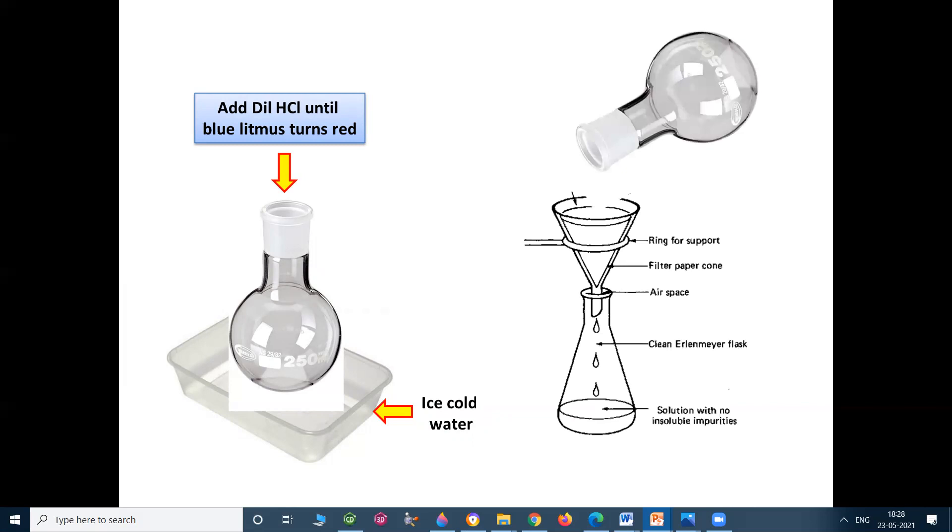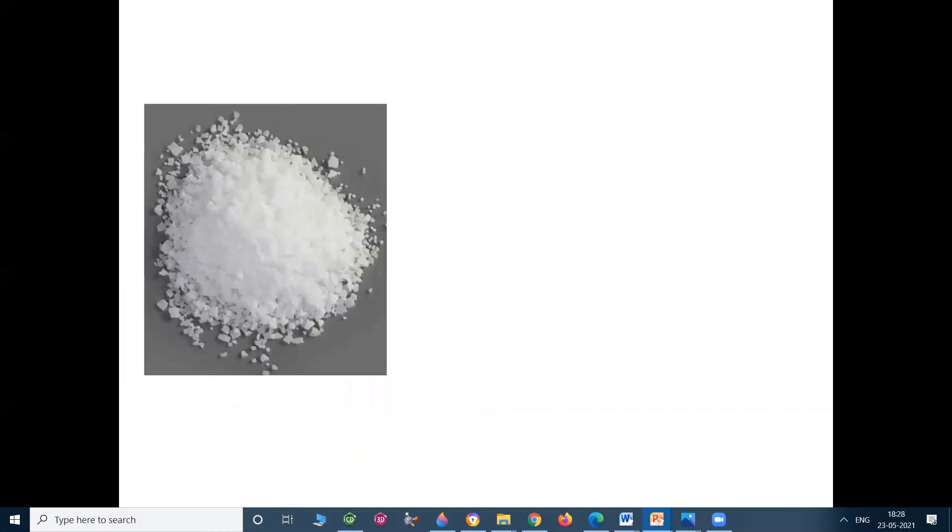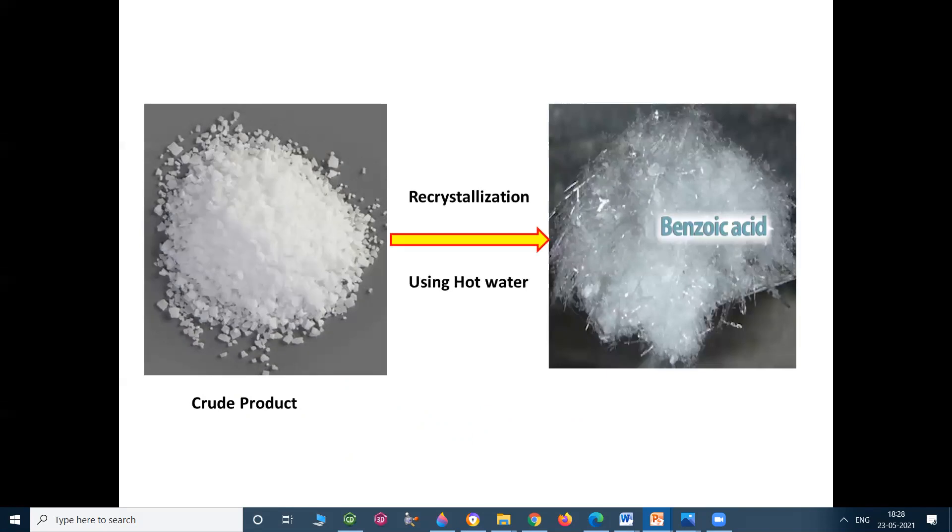Then filter the product by using filter paper and conical flask. After that we get the crude product. The crude product on recrystallization using hot water gives shiny crystals of benzoic acid.